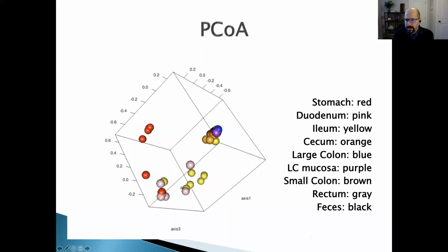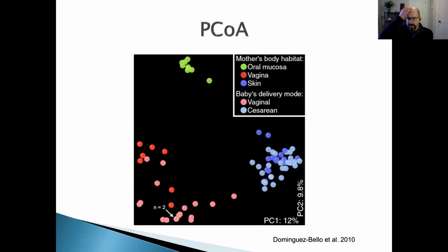Here is where we stopped last class, right? Talking about PCoA and 2 and 3 dimension plots. So I'm just gonna give you a few more examples because this is really, I guess, the most important way that we use to visualize bacterial community similarities.